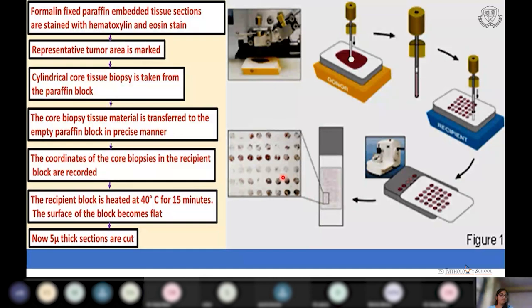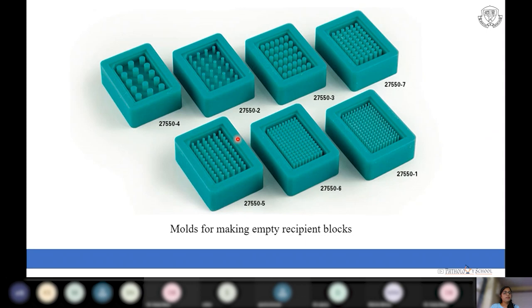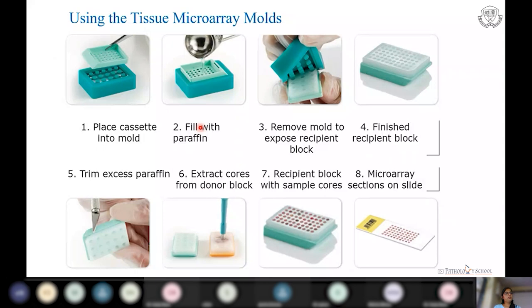There are two methods of making empty recipient blocks: we can manually punch holes in a paraffin block, or we can use molds which readily provide an empty recipient block with orderly arranged holes. We place a cassette into the mold, fill it with molten paraffin — preferably low-melting paraffin — and let it set for one hour. We then remove the mold to get a finished recipient block, after which we pick tissue from the donor block and place it onto the recipient block.